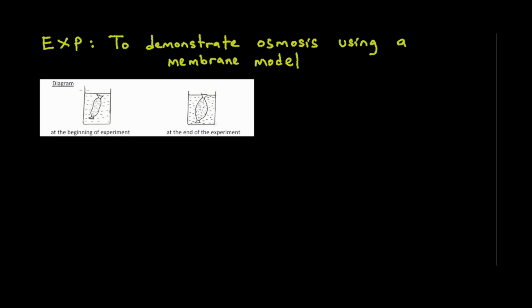Saka tinotanga tiine a beaker. Then we have this, like I say, balloon. It's actually the membrane. Then we have some fluid. This is the before. This is the after. Let us write down the method and see what we ought to learn here.